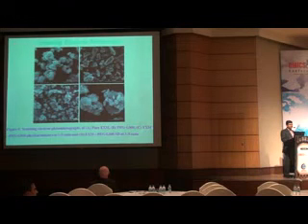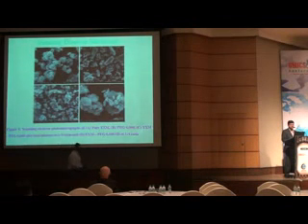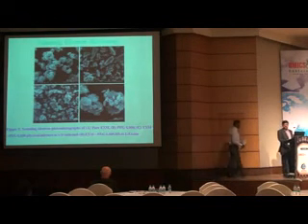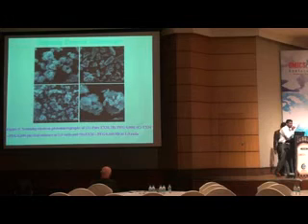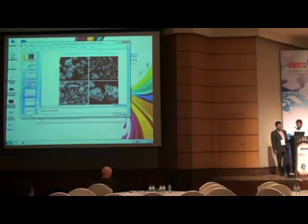So when you are using the peaks at 16 theta and 18.17 2 theta position, essentially you are assuming that the crystalline form is getting converted to the amorphous form, and that there is no other morph transformation taking place. Am I correct? Have you validated that no other morph transformation is taking place by doing any additional experiments?